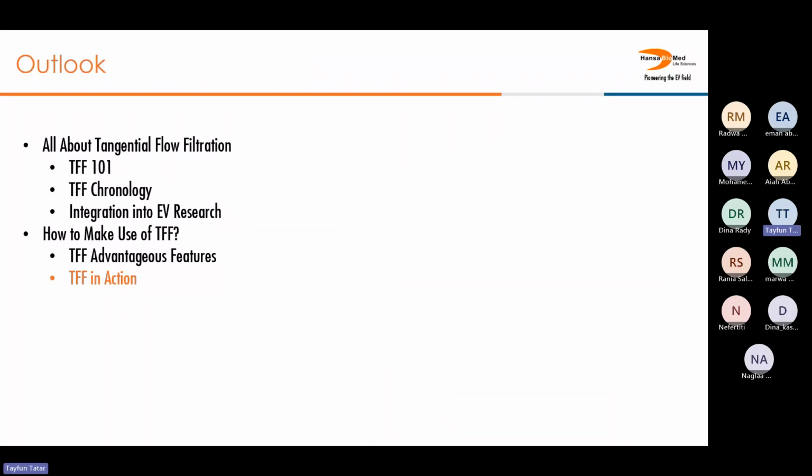And now, finally, I would like to mention some examples in order for you to see TFF in action in different workflows. And I chose these examples to represent the versatility of TFF, both in the sense of processable samples, like cell-conditioned media or different body fluids, and also for the application scenario. So if you are interested in further examples for any of these cases, you can just contact me.